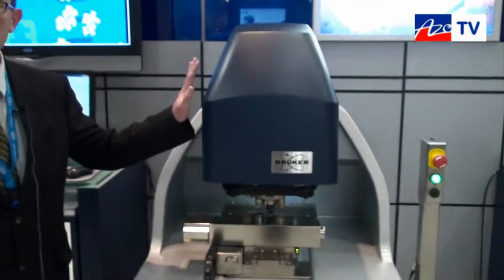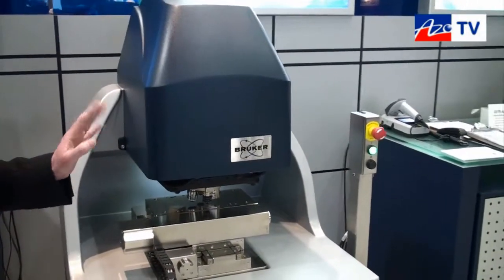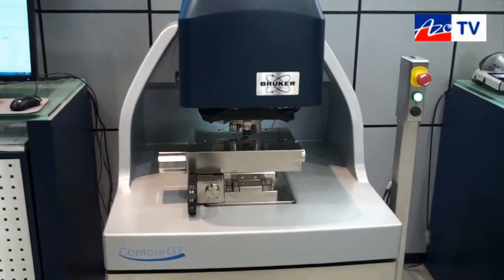This is the Bruker Contour GT X8. It is a three-dimensional microscope. It's the 10th generation of this technology, and what it will do is provide you with a three-dimensional image of your sample surface.